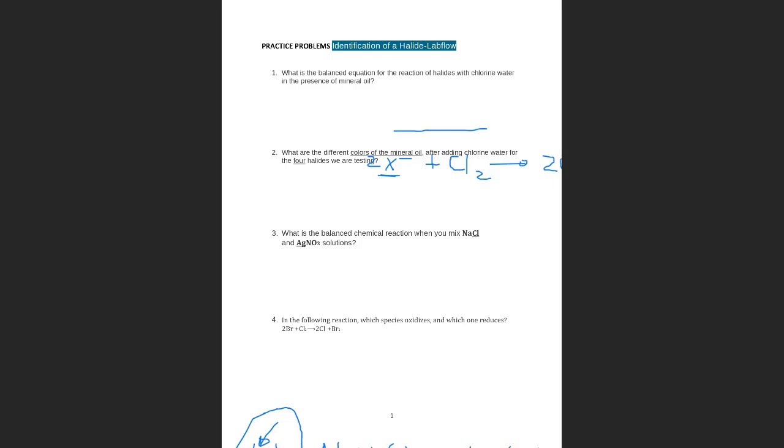But if you have bromide, you need a little more, and for iodide, you need a little more. That's all it is. And you will see that in the report. And I would say that this is all a qualitative analysis of just these 4.